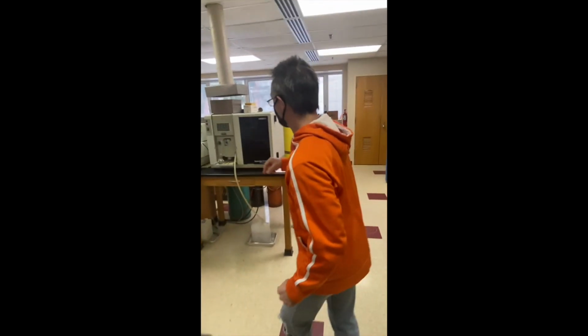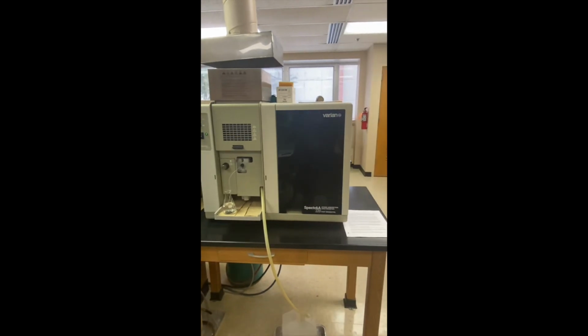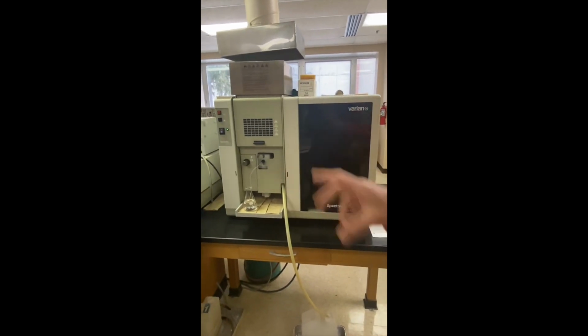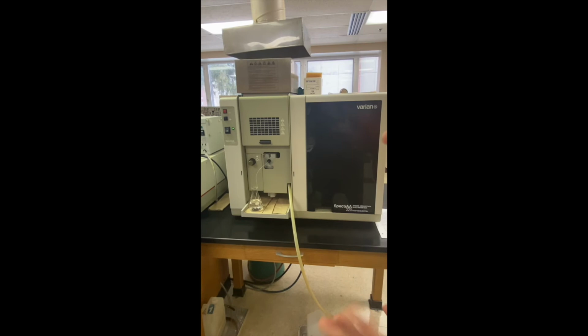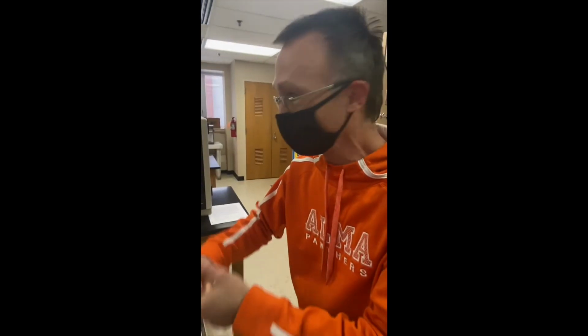How cool, thanks. Okay, so this group of students is talking to Dr. Straight, and we don't want to get in their way, but come a little closer. This instrument here can actually measure metals, again, in soil samples. There's a big furnace over here that ignites a sample and it lets off a color based on the metal. Like, you ever seen fireworks glow red and orange and purple? It's all based on metals, and this can measure it.